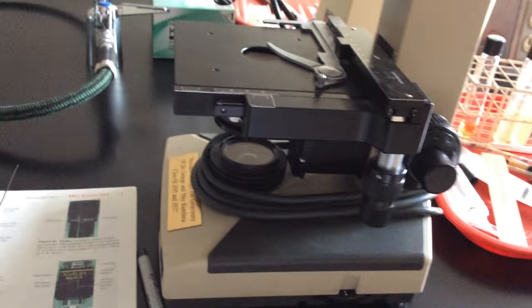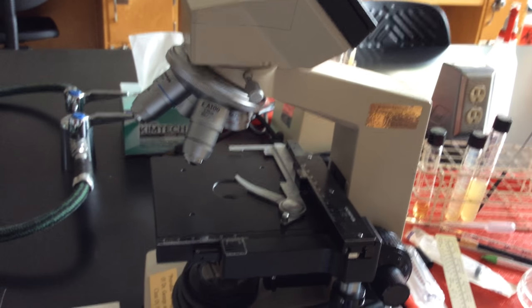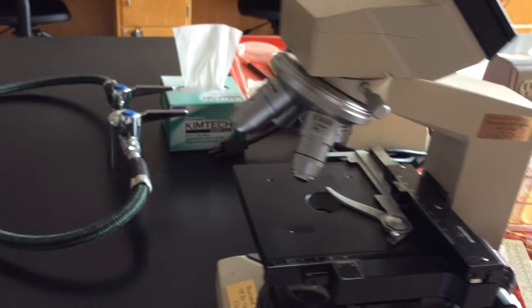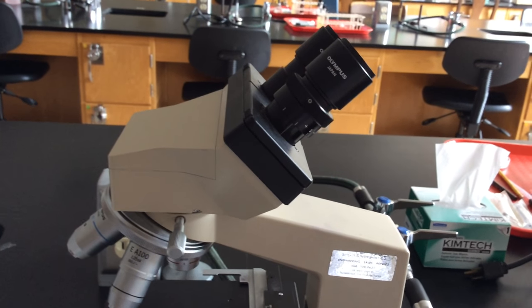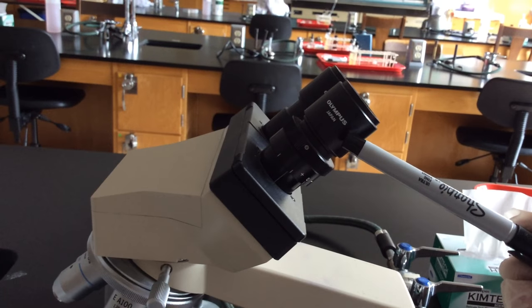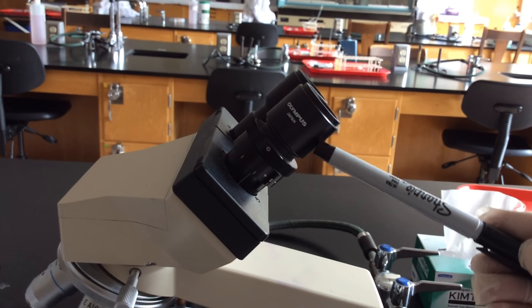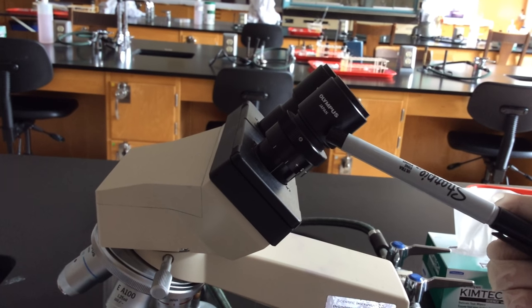So we're moving over to our Olympus microscope here, and hopefully we can go through the parts. Let me move this so we don't have quite so much background. Just take a little moment here. All right, so then we could go ahead and maybe do a little quiz together. Can you identify the structure at the tip of the pointer? Okay, these would be the oculars. The oculars are going to magnify the image 10 times.